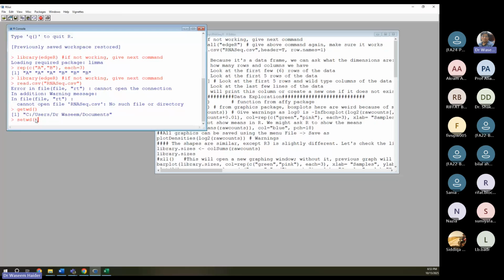So what I can do is quotes and Control V, but I need to change one thing. What is that? When I copy from the path, there is one thing that I need to change. Anybody? My cursor is pointing at it, right? Here the slashes are forward, and in the copy-pasted path, the slashes are reversed. You should make them forward slashes. These are not opposite to that.